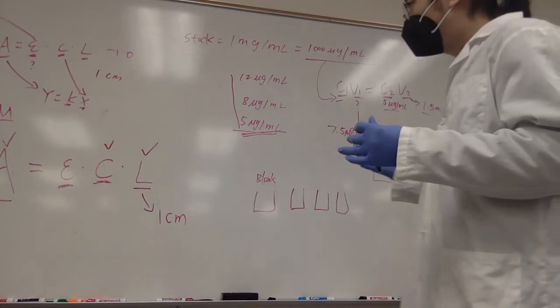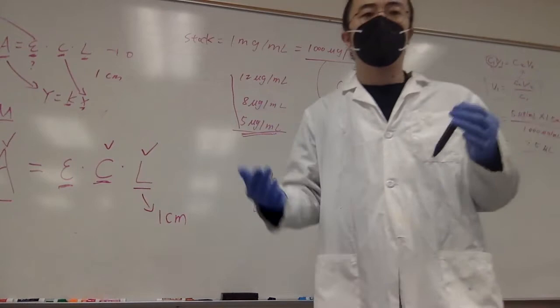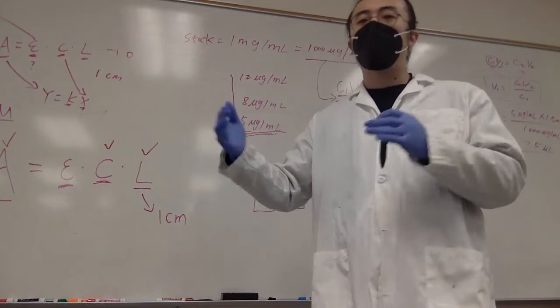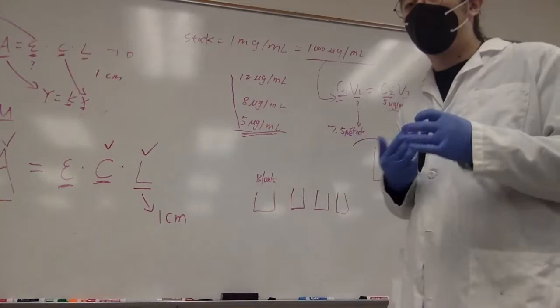That is a very important skill for this semester of this lab, because usually we will just provide stock solutions, and you guys need to dilute the stock solution to the working concentration for the following experiment. So it is very important to understand how to make dilutions.